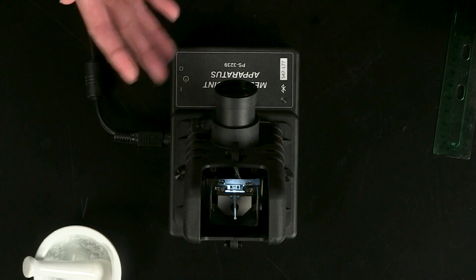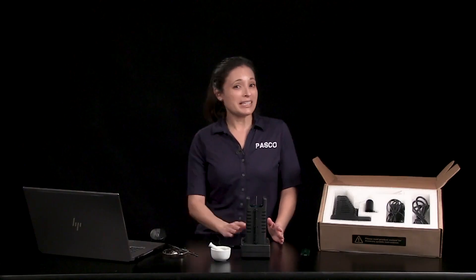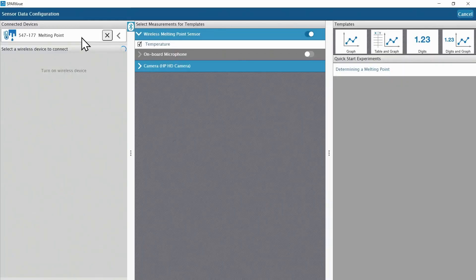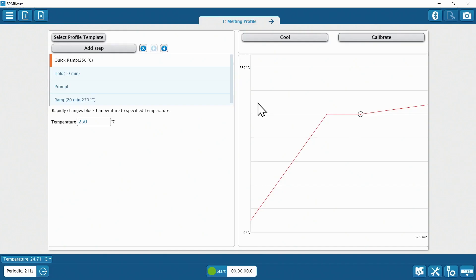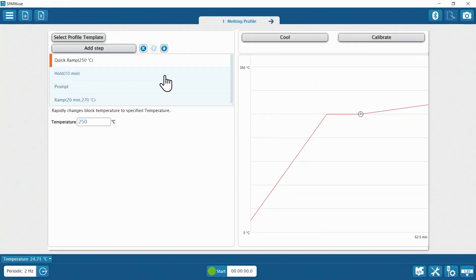The power is on, so the sample is illuminated and the built-in fan is quietly running. I have already connected the temperature sensor built into the apparatus via Bluetooth and SparkView, so the determining a melting point quick start experiment is available to open. You'll see a heating profile on the left, which allows the user to control how quickly a sample is heated. These are the default heating profile steps, and a live temperature reading is available below it. The right side shows a temperature-time preview based on the profile settings.